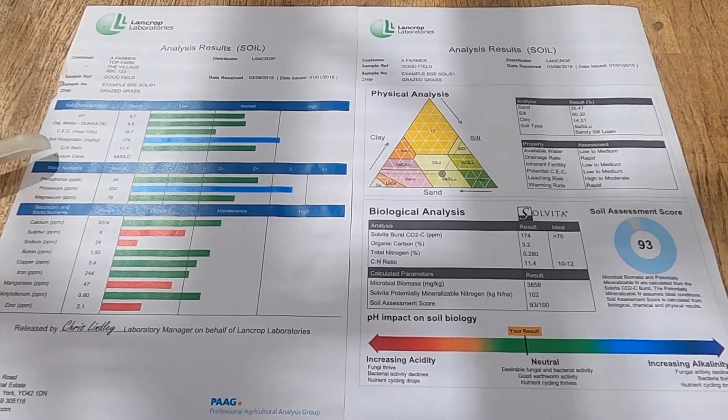Carbon to nitrogen ratio comes next. That's a good indicator of the rate at which organic matter is being broken down. As carbon to nitrogen ratio rises, carbon cycling is slowing. Conversely, if carbon to nitrogen ratio drops, that shows that we may be burning through carbon too quickly. We have an accurate textural classification, a little bit more on that in a second. Well, that summarizes and completes those major soil characteristics.